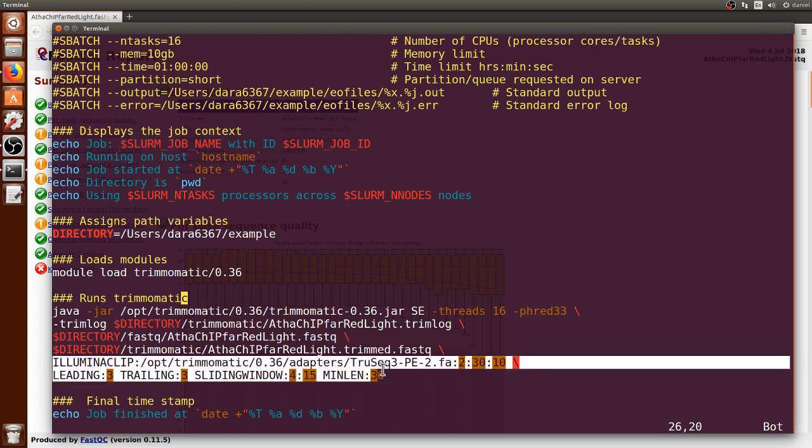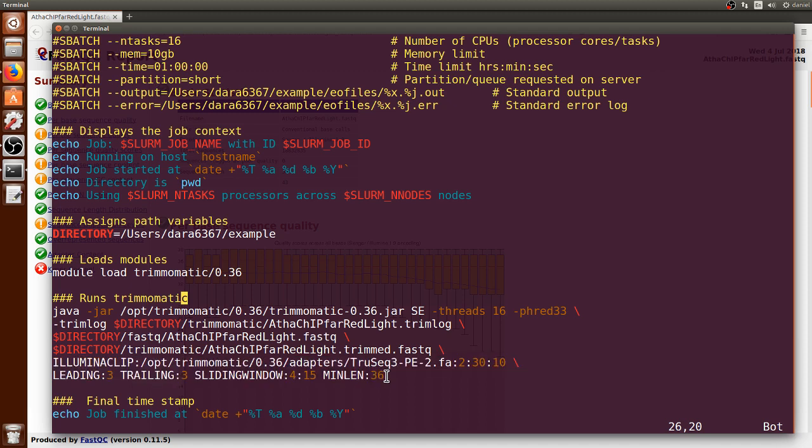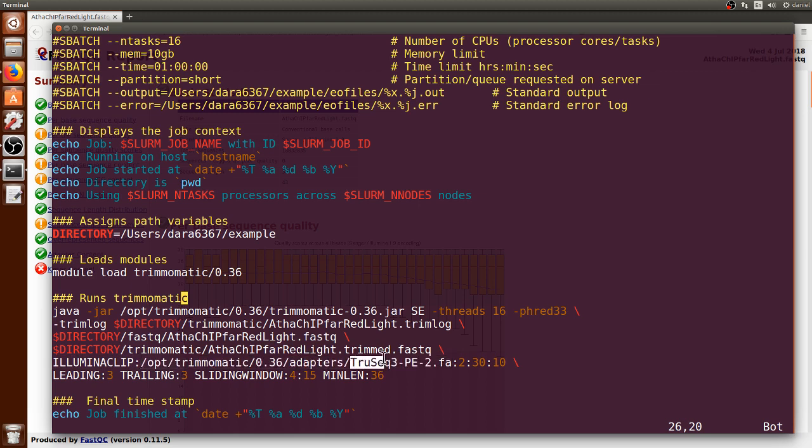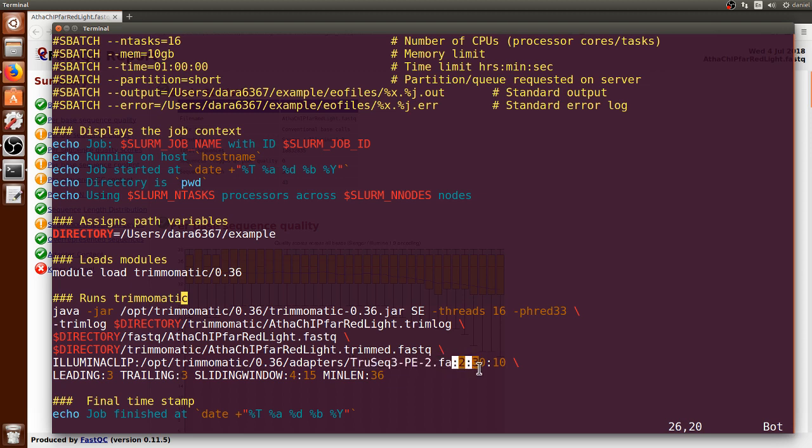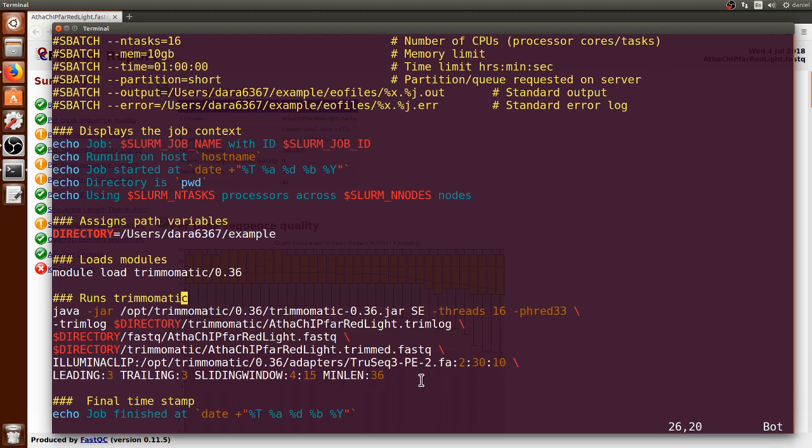Finally, I am putting these two lines that contain the options or specific conditions that I want to use for Trimmomatic. I'm putting here the path of a FASTA file that contains the adapters that were used for the generation of the libraries for the sequencing, and some of these conditions or options that were described in the previous video.